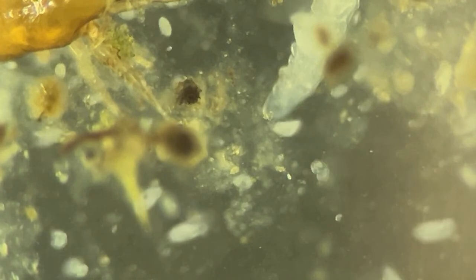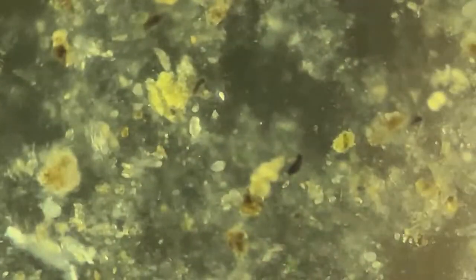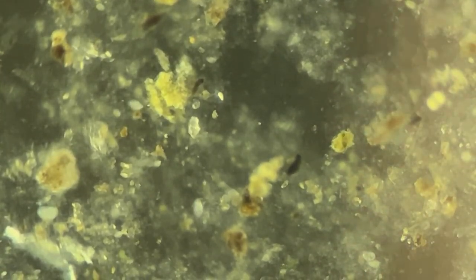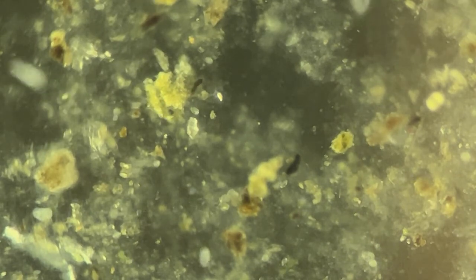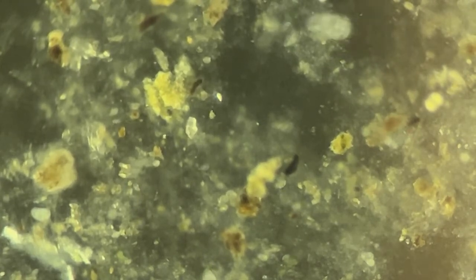So, the protozoans, let's focus on these creatures. Now, if you ask me the magnification, the objective is 4x. The eyepiece is 10x, that is 40x. Three times magnification by the camera, that is about 120 times. Could be more.